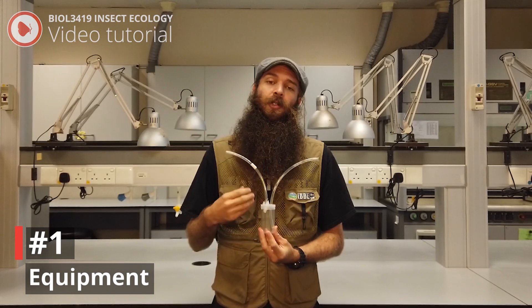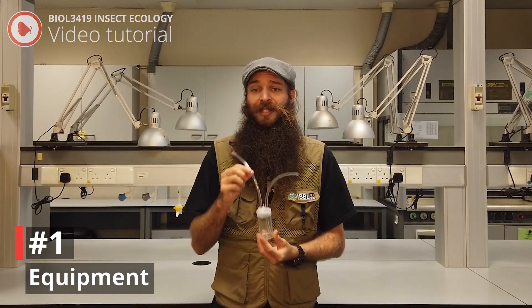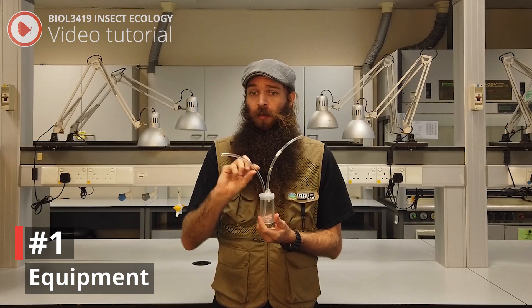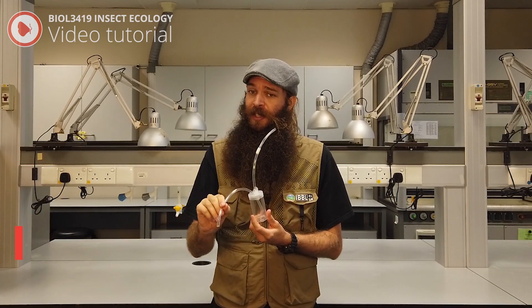Quick note on aspirator use: you want to make sure you use your aspirator correctly. The tube with the tape on it is the end that you put in your mouth and inhale. And the other tube, the longer tube, is what you use to collect the insect.